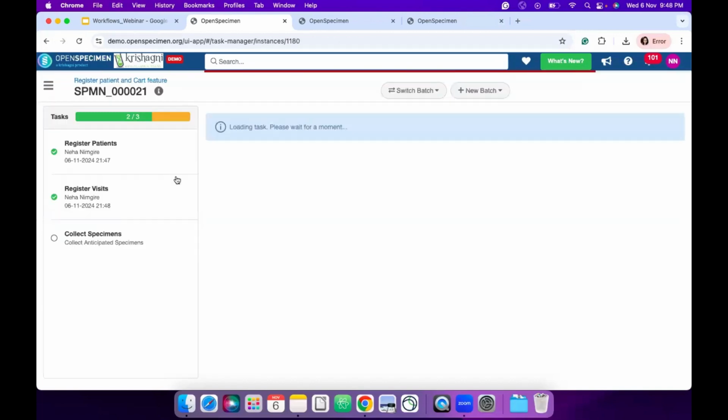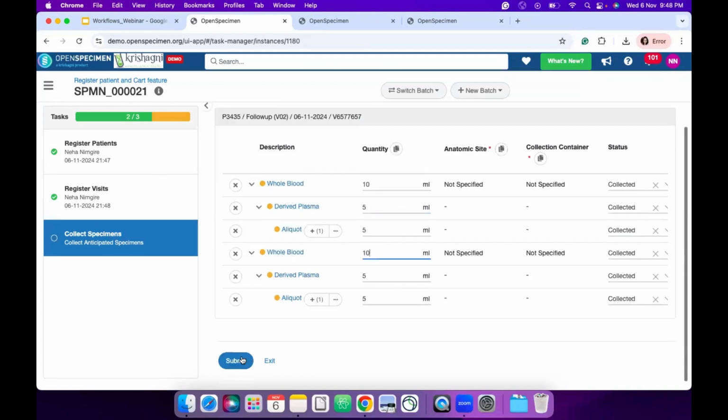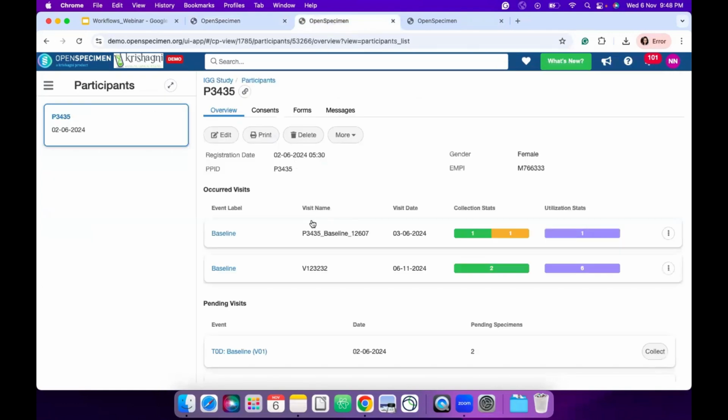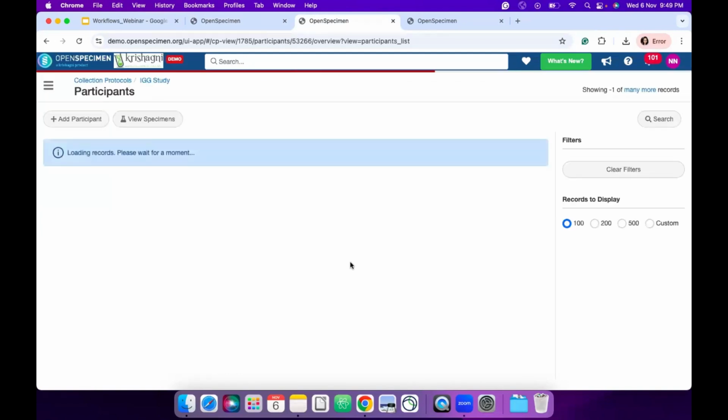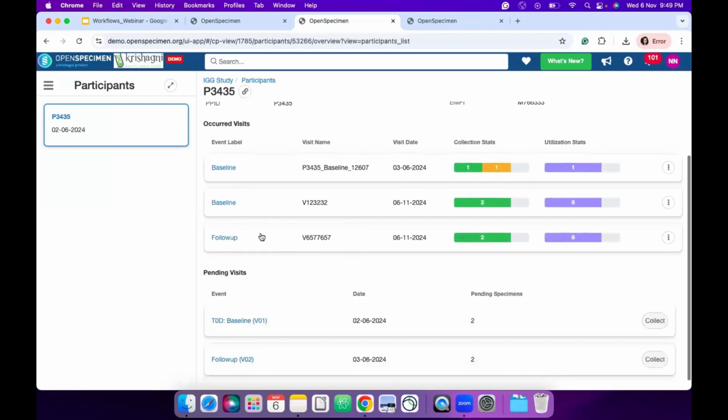And I accidentally went back. Yeah. So this is the batch. Let me just re-enter this and hit submit. Okay. So now my batch is completed. There will be a new visit added for this patient. Okay, which is the follow-up visit.